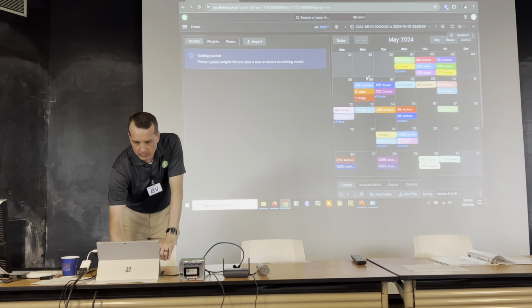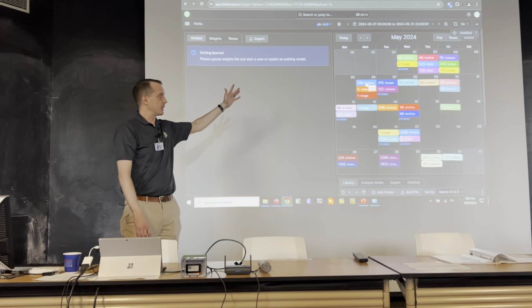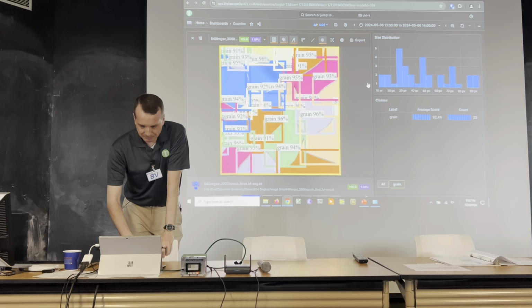So we can go back in time, and we can see I've been doing a lot of different experiments on this particular device. It tells me how many images I've collected, where they've gone, and so on and so forth. But let's take a look at one particular image here.